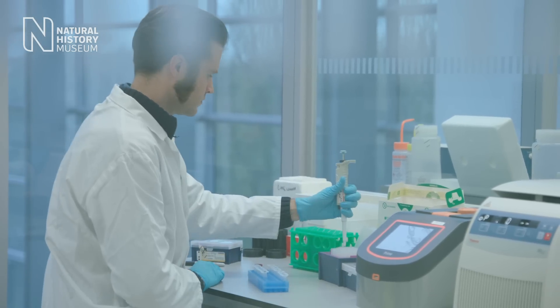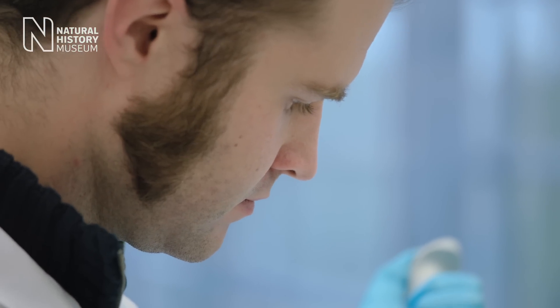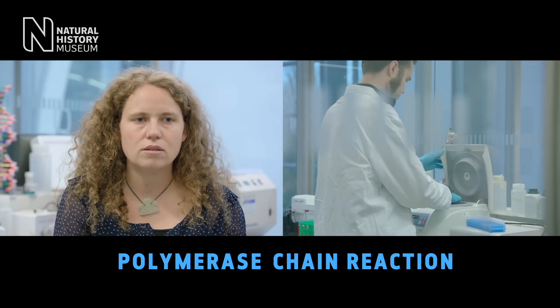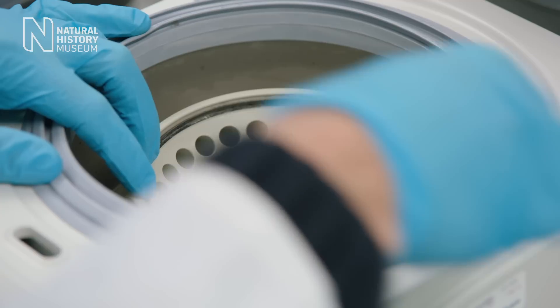Step one is to prepare the samples for sequencing. Before we sequence them, we have to do something called PCR to extract the DNA. PCR stands for Polymerase Chain Reaction, and it's a method where we can generate many copies of a DNA fragment.